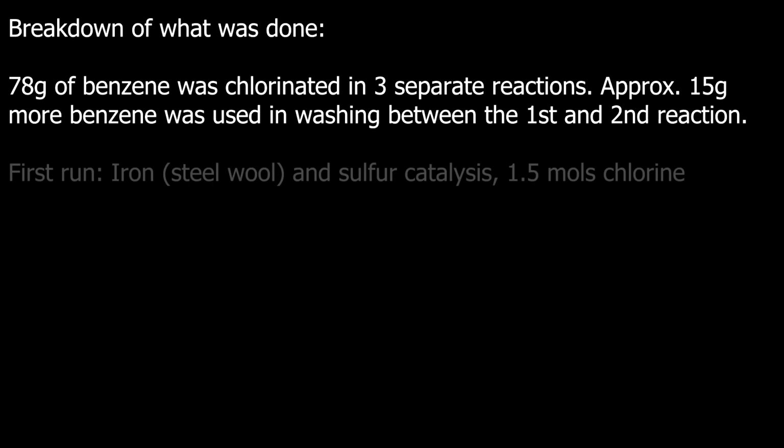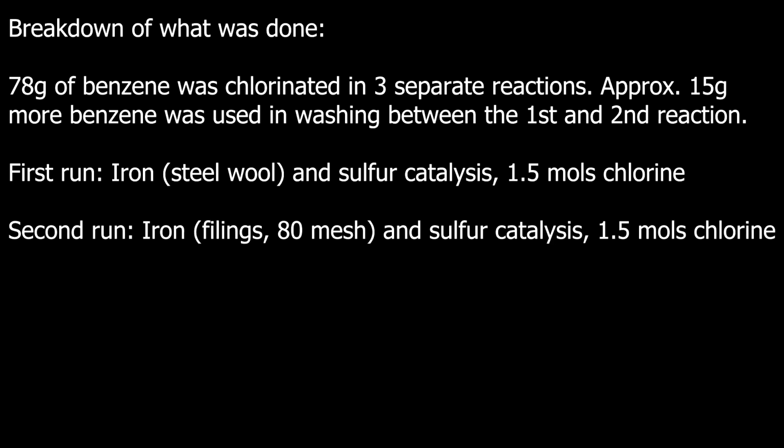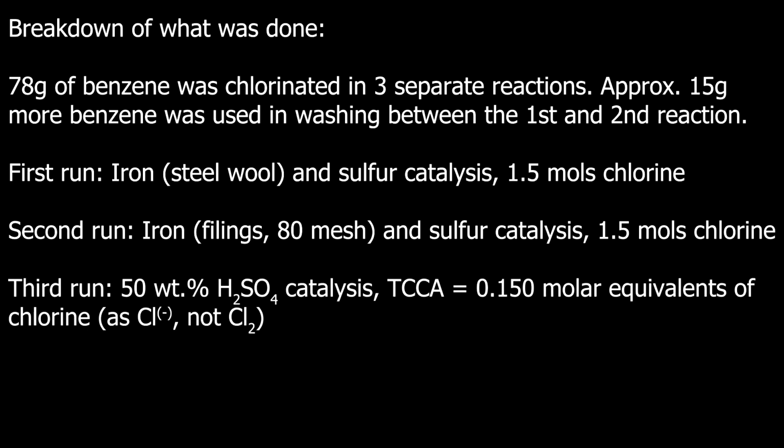The last fraction did look substantial, but it was mostly p-dichlorobenzene dissolved in chlorobenzene and ODCB that co-distilled, and when I purified it by fractionally freezing it, barely any liquid passed through the filter, so I just chalked it up to a trace amount of ODCB.